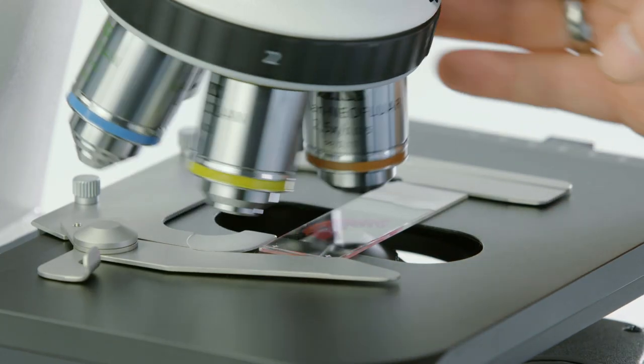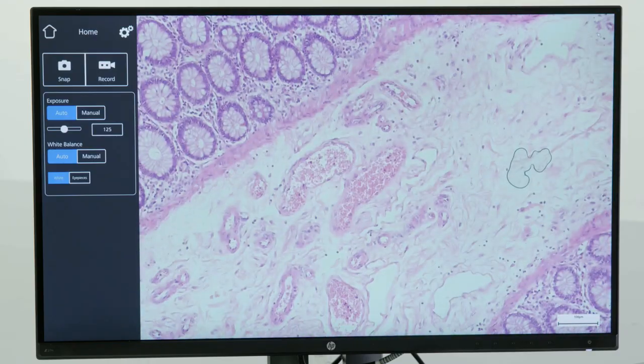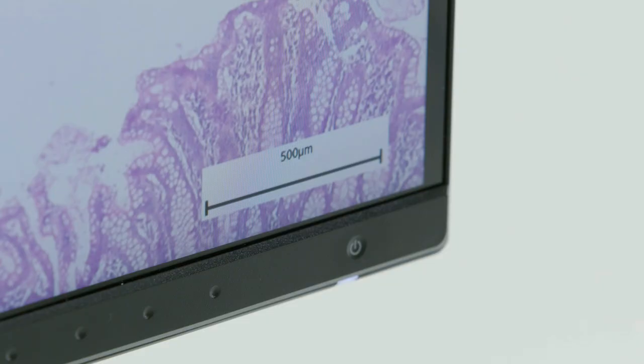Now, use a low magnification objective to focus your region of interest, then switch to the magnification you need.